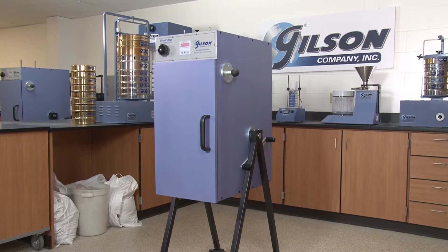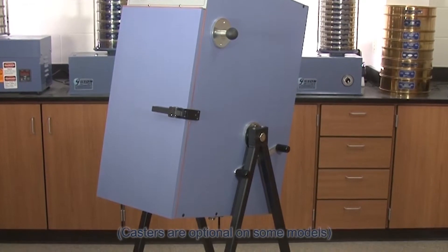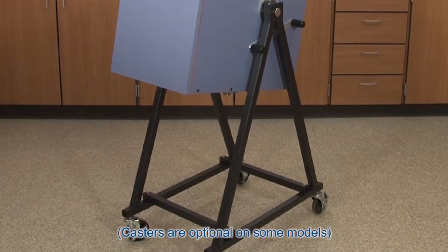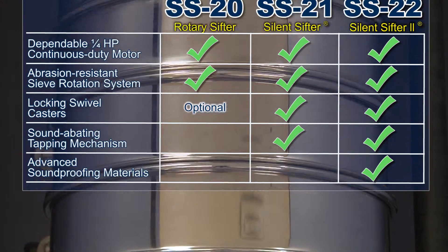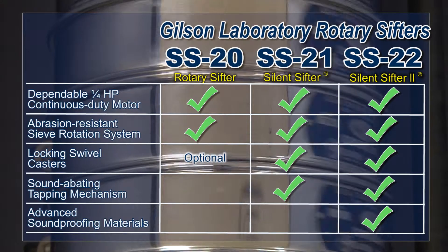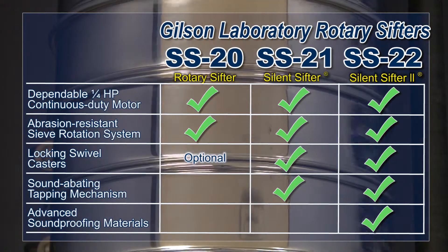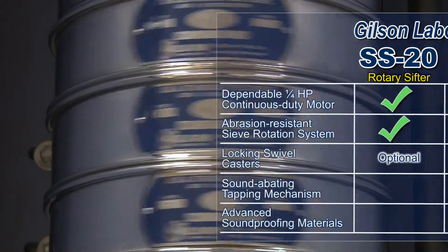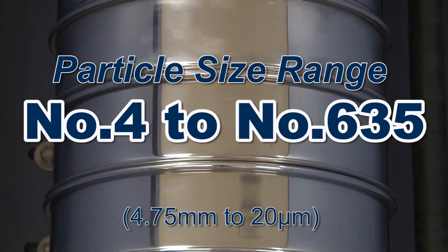All Gilson sifters have a totally enclosed cabinet constructed with dense impact-resistant MDF board and a sturdy heavy steel stand, allowing for safe and dust-free operation. These dependable units have a quarter horsepower continuous duty motor and an abrasion-resistant rotation system. Sieves rotate reliably and accurately to separate particles from number 4 to number 635 sieve sizes.